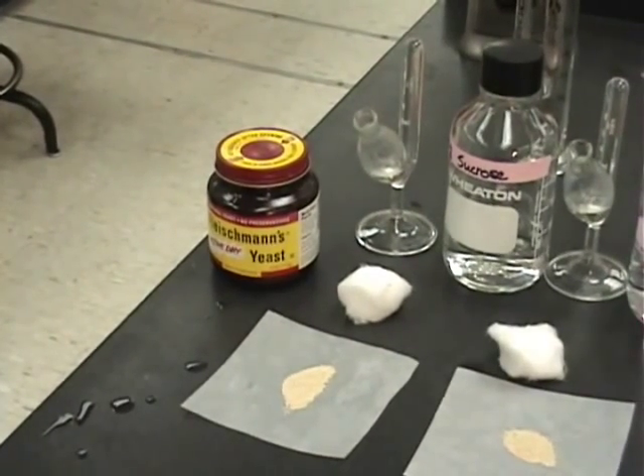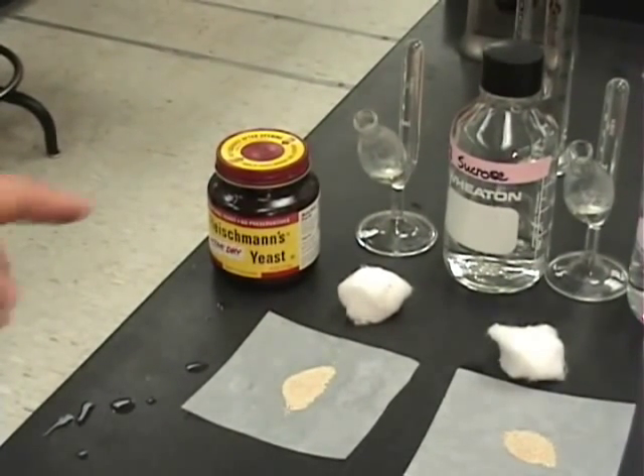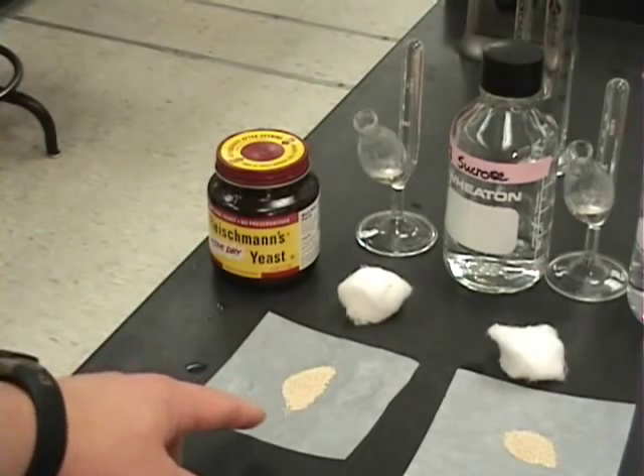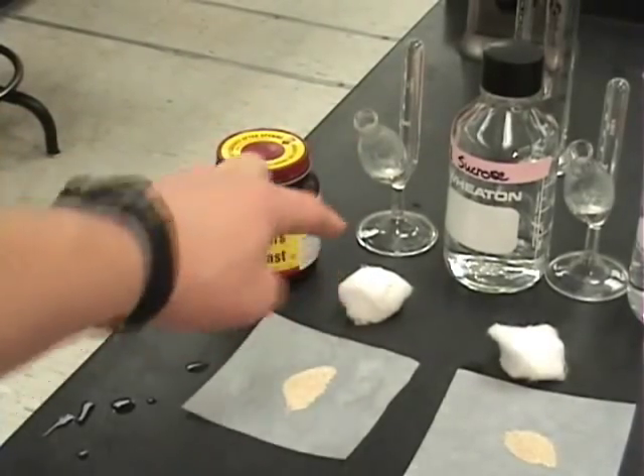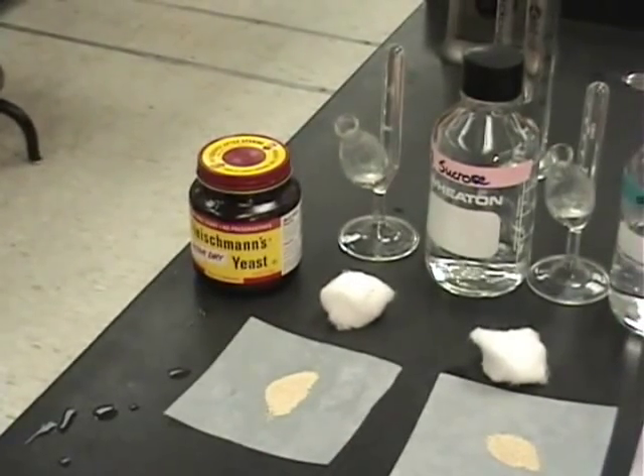This is the yeast fermentation experiment. Here we see 0.5 grams of yeast, the Smith fermentation tube, and the cotton ball which will plug it to hold the gas in the tube.